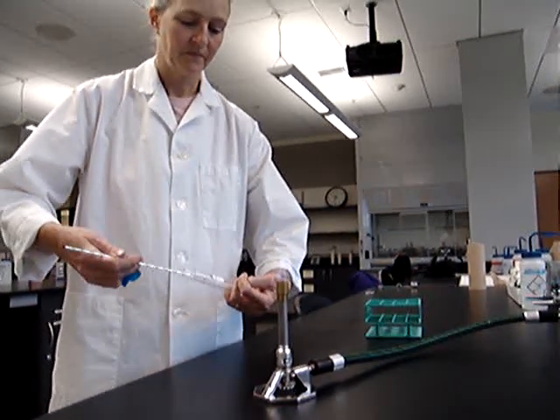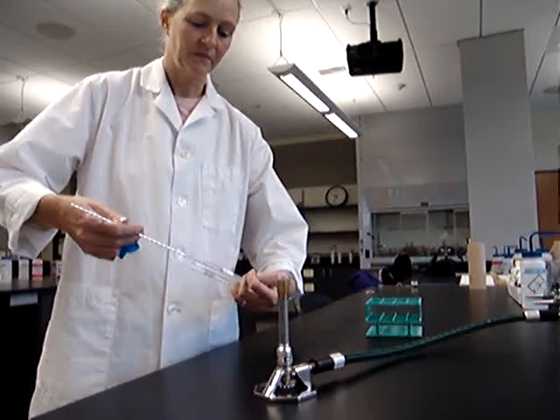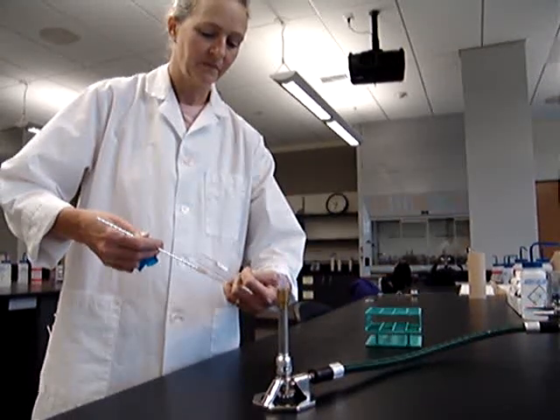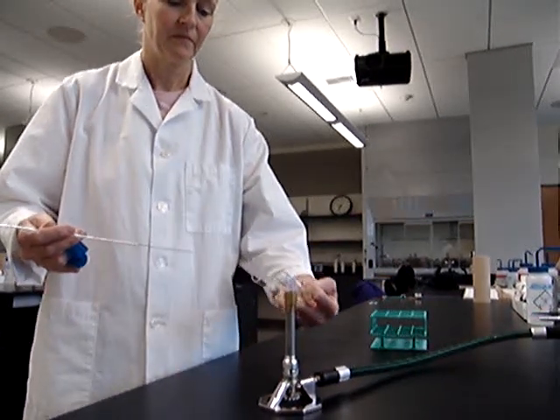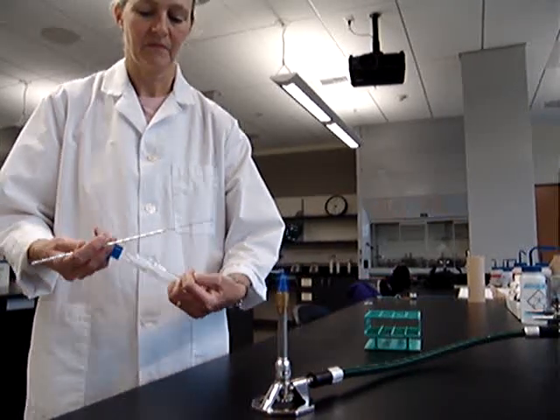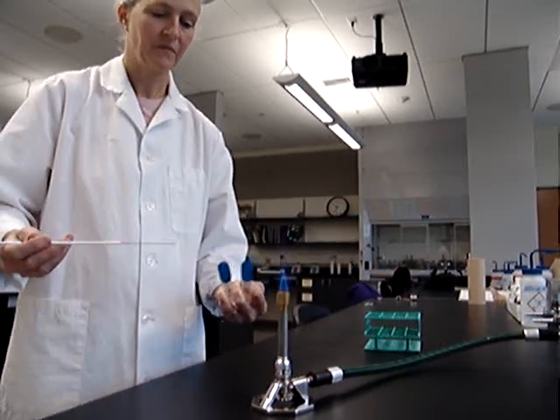First, she places her loop into her culture, gets a bit of culture, and then she places it into the inoculating medium, being careful not to touch the rims. She then sterilizes the rims again of her tubes and carefully places her tops back on.